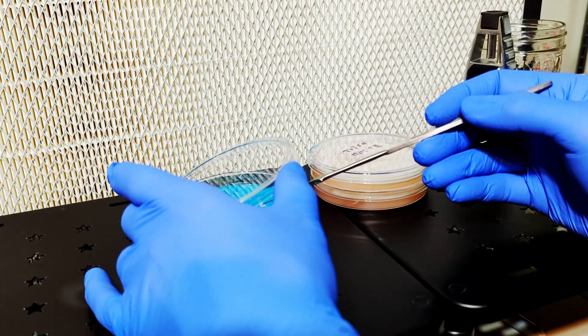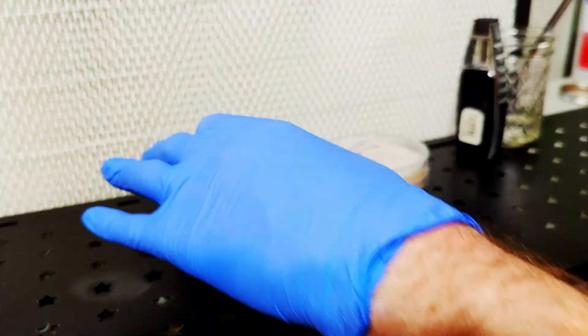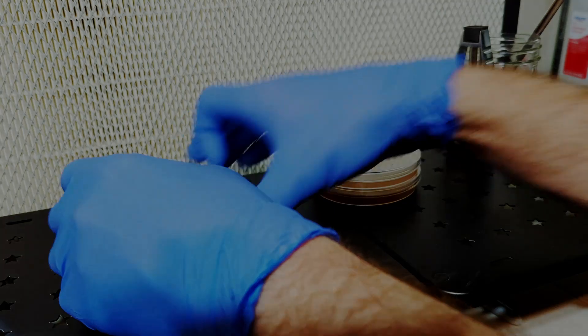While doing lab work, you need to always be mindful of where your hands are and what they're doing. In the beginning, recording your lab sessions and watching them afterwards can drastically improve your technique. There is a lot you can miss in the heat of the moment, but the camera sees everything.